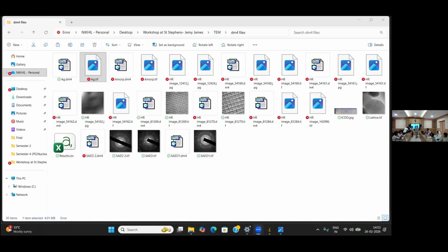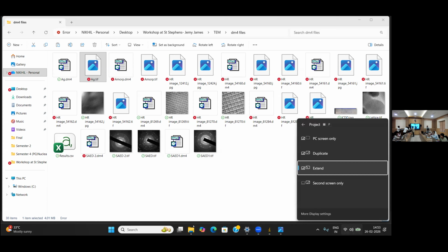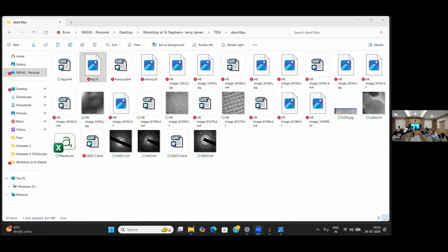Okay. So after that, we should set the scale using this Analyze window. Can you see this Analyze window there? There you can see Set Scale. Before going to set scale, you just take that Set Scale. Then in that window, you just clear all the remaining scales. Yeah, please remove the scale. And then go to the main window. There you can see a line tool.